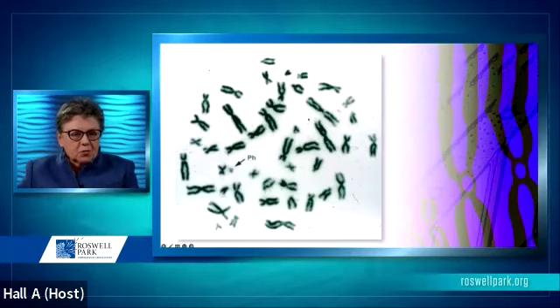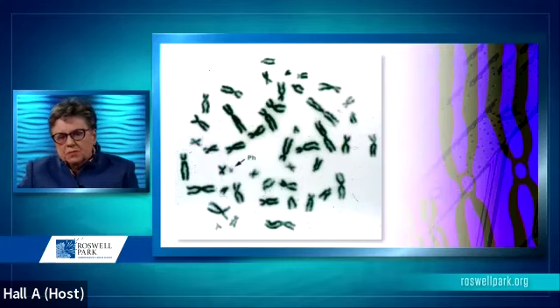No bands were on the chromosomes, but we were able to identify the chromosomes based on the length of the chromosome and the position of the centromere, and we were able to group these chromosomes into groups to identify them.